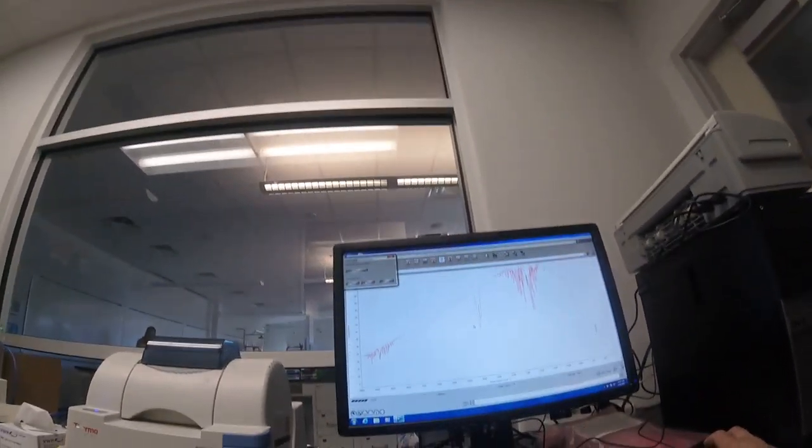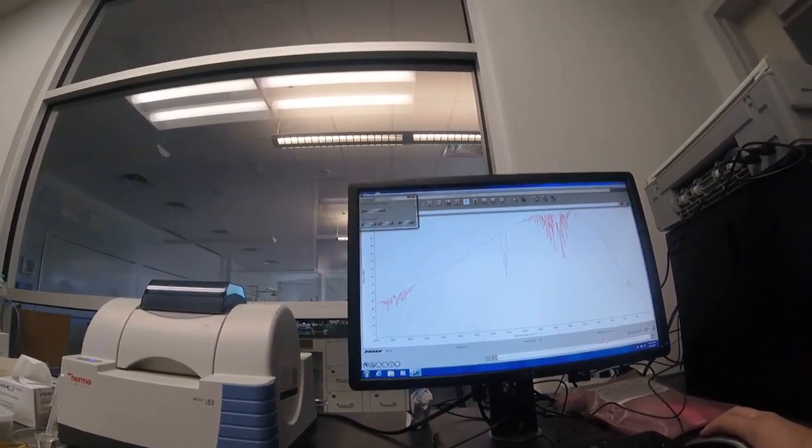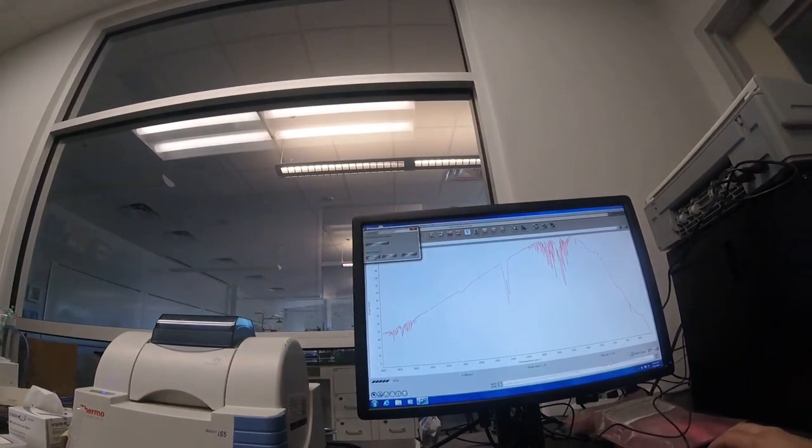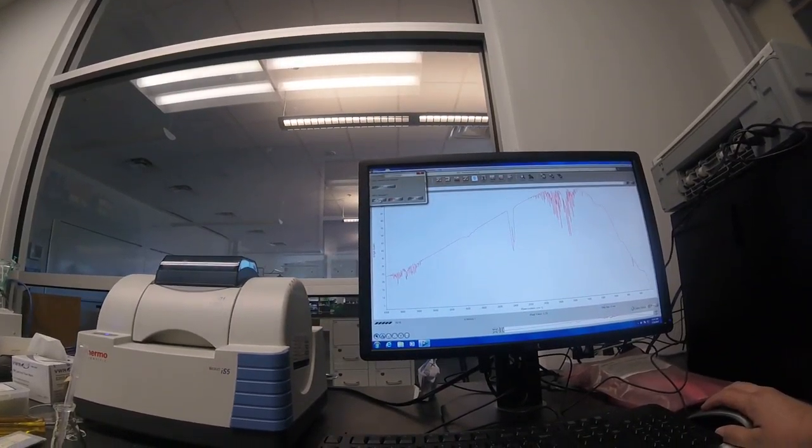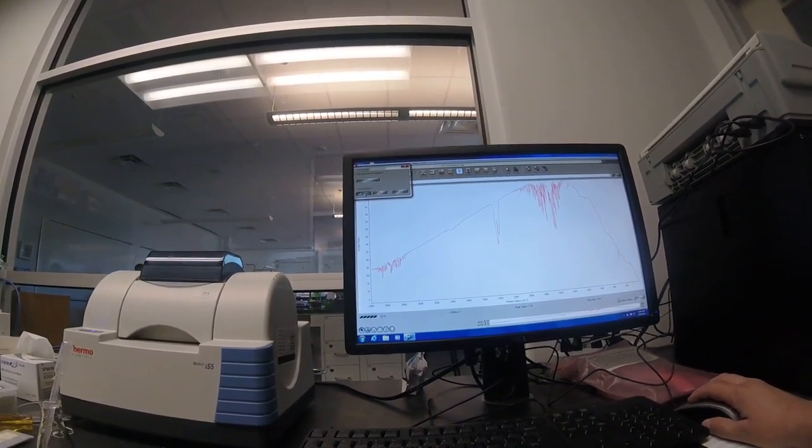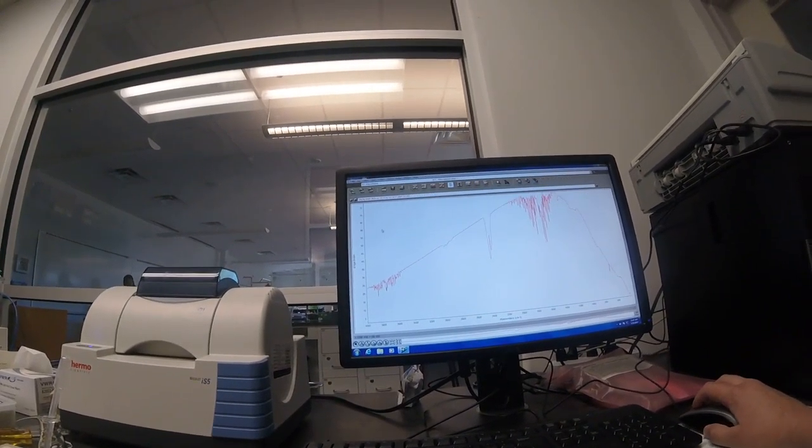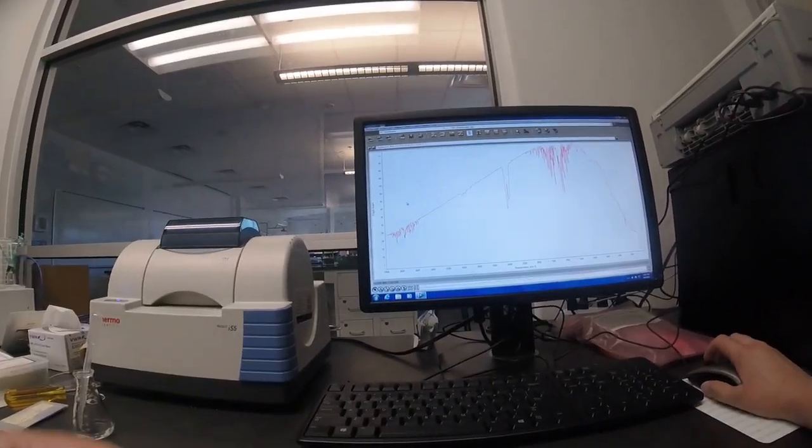So once the data collection is stopped, you can say add to window. We want to add that to the window. So yes, we want to do that. Now I want to do my sample.